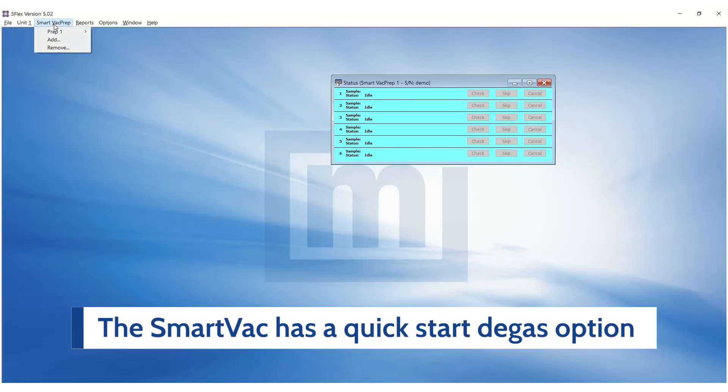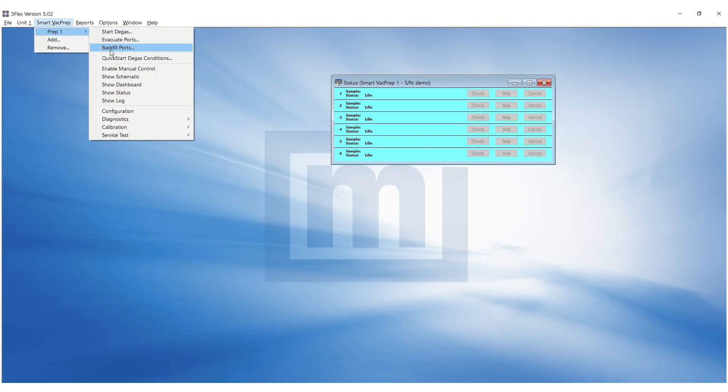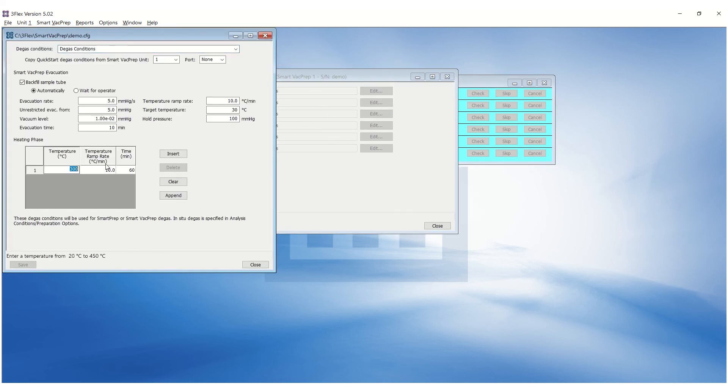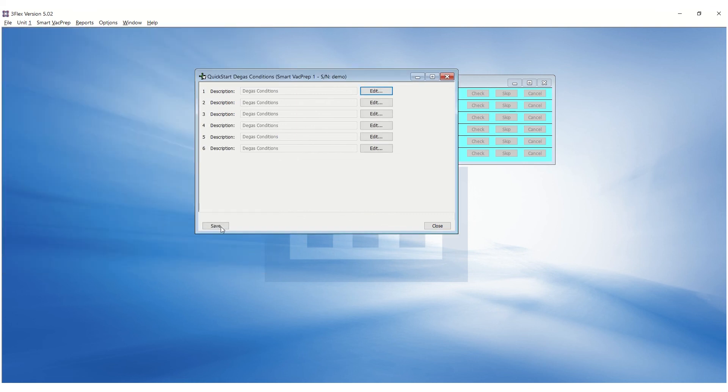There is an option to quick start degas. On the software, go to the SmartVacPrep menu, prep, and quick start degas conditions. Click on the edit for each port to enter desired degas conditions. Save and close the degas conditions. Save and close the quick start window.